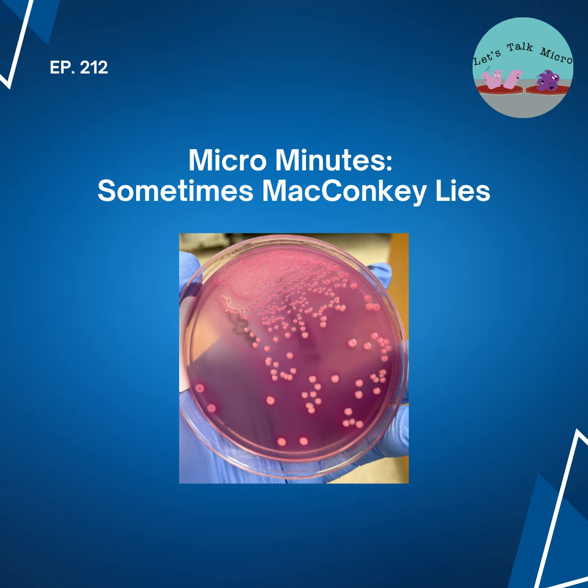Now let's jump to the other myth. Myth number 2: if it does grow on MacConkey, it must be a gram-negative rod, right? That sounds very simple. I just talked about MacConkey and said that it is selective for gram-negative rods and differential for lactose fermentation.